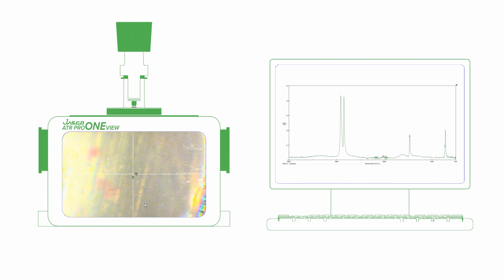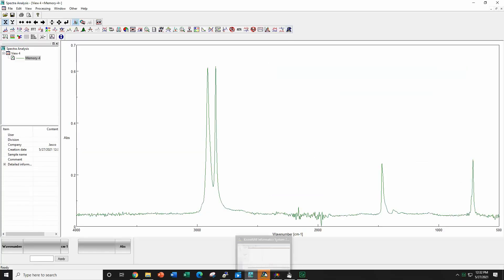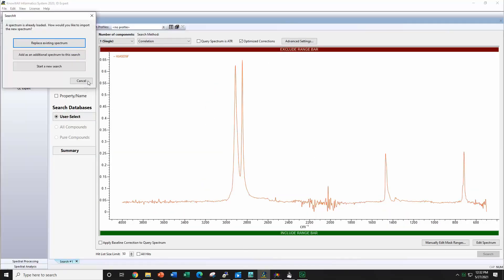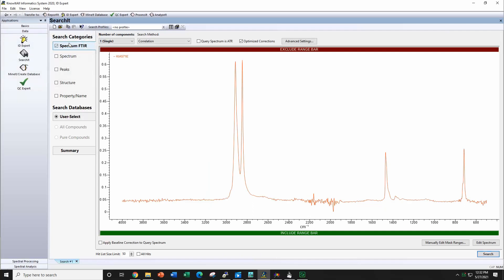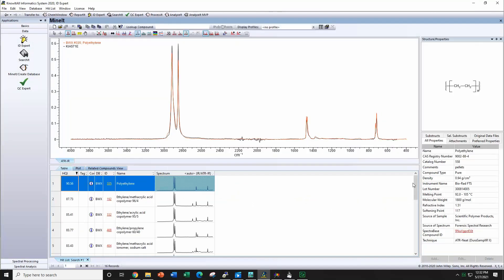This sample is quite large, so it can be measured using the ATR accessory. We can see how the sample is in contact with the crystal. It is searched in the FTIR database and it is confirmed that this sample is polyethylene.